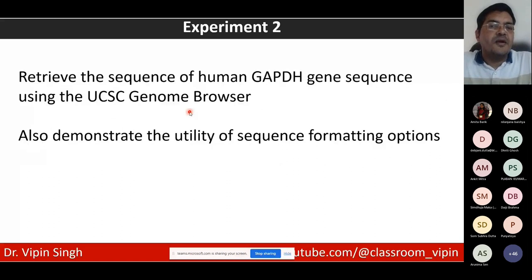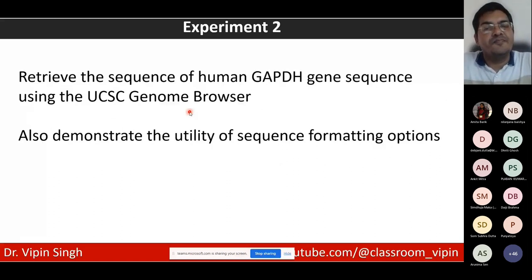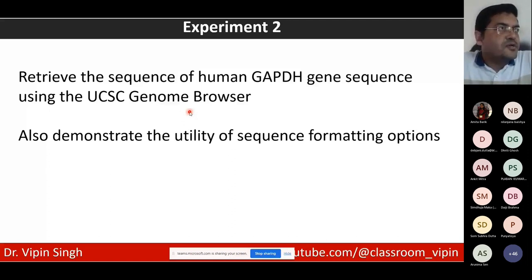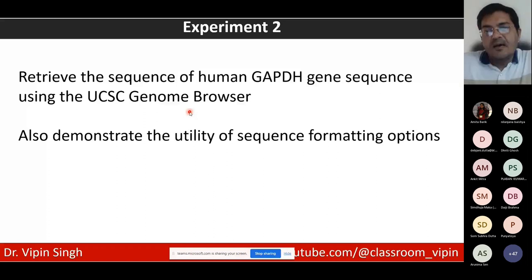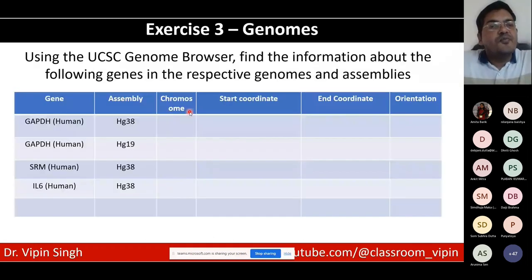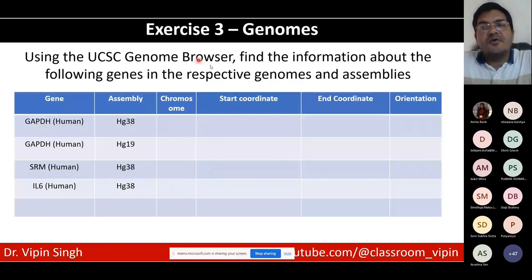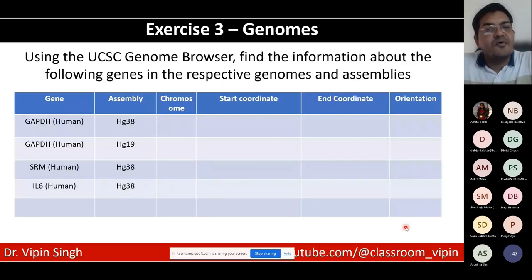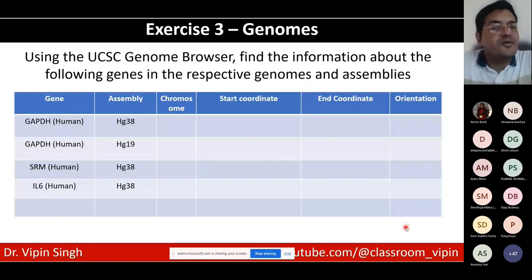We also retrieved the sequence of the human GAPDH gene from the UCSC Genome Browser and examined the various sequence formatting options available. Those who attended yesterday can take a screenshot and practice using the UCSC Genome Browser. Moving on, the FASTA format is a sequence format with only the sequence itself and one extra line — the definition line — which begins with a greater-than sign.